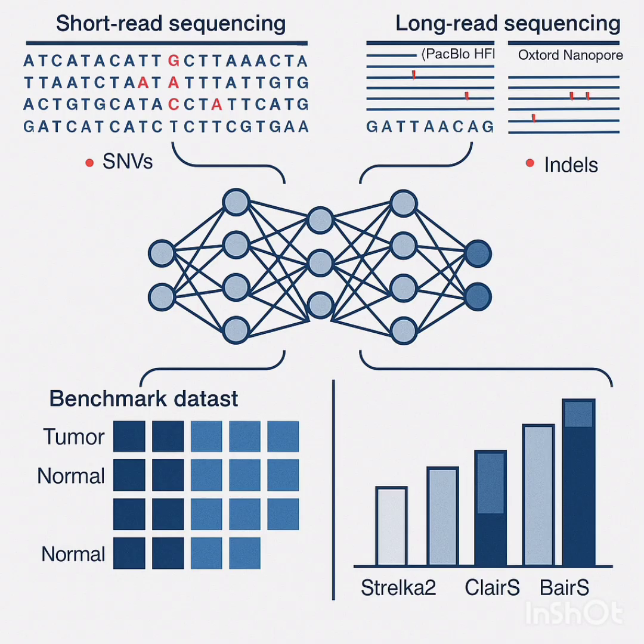Okay. So if a variant shows up frequently in the general population or in that panel of normals, it assumes it's probably inherited, not a new cancer mutation. That's the logic, yes. The tumor-only models using this approach get pretty good recall, meaning they find most of the true somatic variants. The precision, telling true from false positives, is a bit lower than the paired mode right now, but it's still very useful. That's still a big deal for those cases.